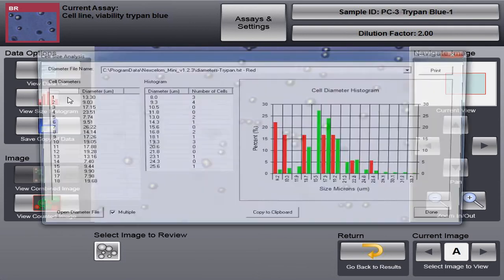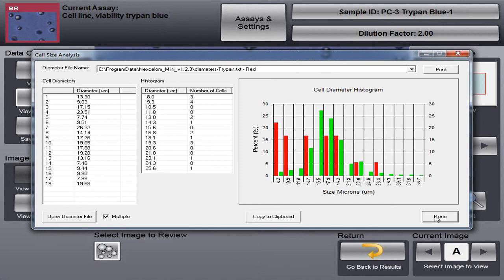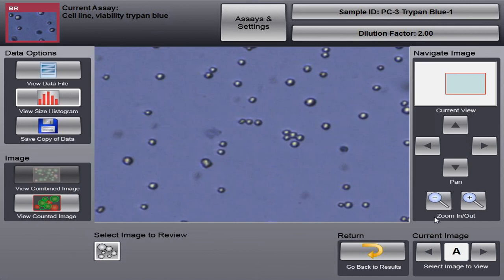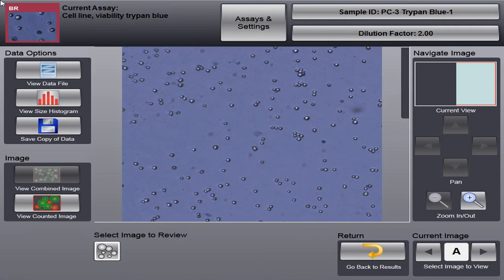And our size histogram is going to look a little bit different. We have two populations now. Our live cells in green and our dead cells in red. So that's our Trypan Blue assay.